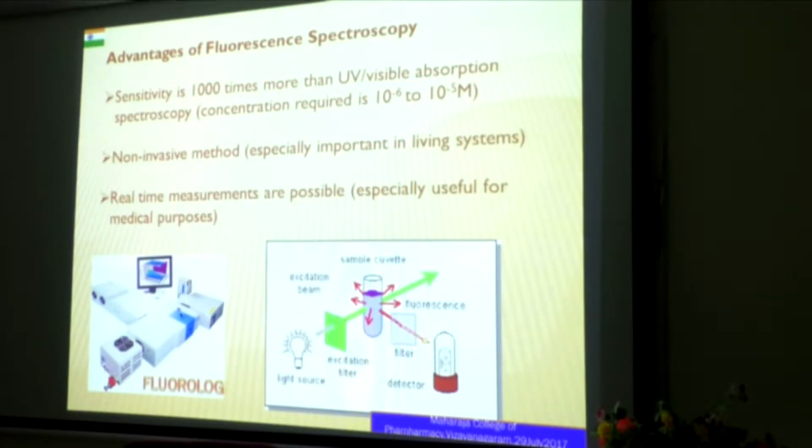Nowadays we have fantastic grating technology, so you can tune to that level. We have a double monochromator, that means two times we have put gratings, so you really resolve that excitation wavelength to a very accurate value. You can buy a single monochromator, a single grating, also, but we purchased this.